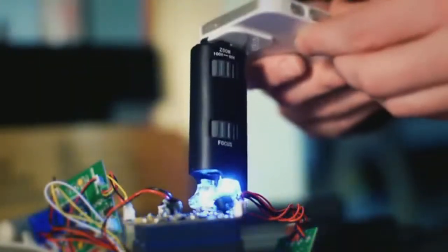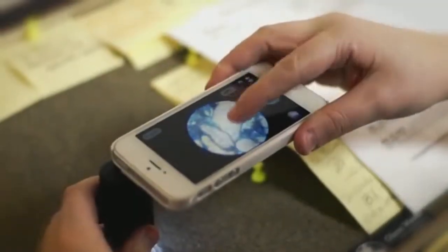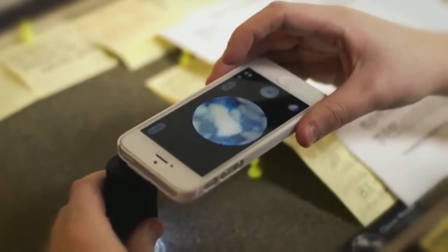Once you've decided what you want to magnify, place the Micromax directly over the object and use the included zoom and focus knobs to achieve the sharpest image possible. When in camera mode, tap the image on your screen for a sharper focus.